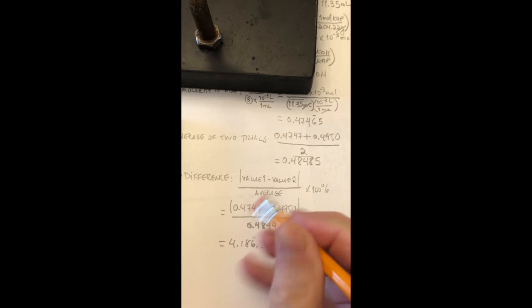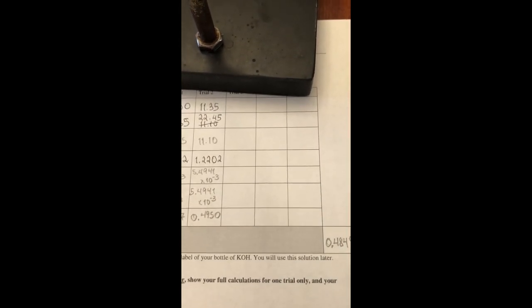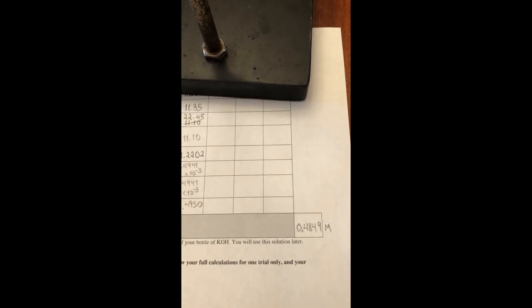I'm sorry. That's not where the bar goes. I'm going to put the bar on top of the last significant digit. So this is 4.19%. In other words, this is okay. It is less than 5%. And so that's my result. In the lab, what we would do now is we would go back to our little storage bottle of KOH. Let me bring this down a little bit here. What we would do now is we would go take our bottle and we would take a label or a marker and write down the correct titrated concentration for this KOH. It's no longer approximately 0.5 molar. It is now 0.4849 molar.